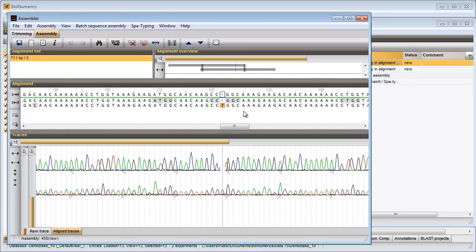I can take a look at the curves to check the base calling or I can screen the consensus sequence for repeat matches.